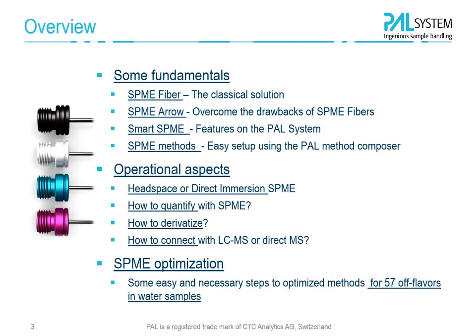We will move on to some fundamentals of SPME fibers and the SPME Arrow, and also see how automated methods are easily set up on the PAL system. Then we move on to the application side. Headspace or direct immersion SPME, quantitation and derivatization are subjects to shed some light on. Besides GC, also LC and direct MS couplings are in use as well.